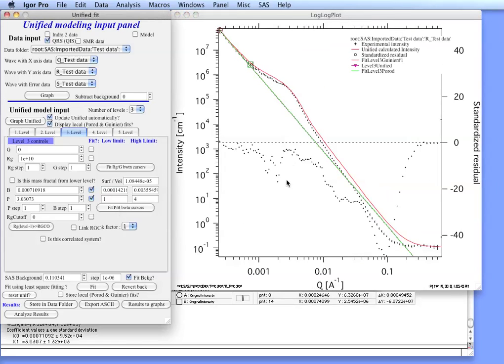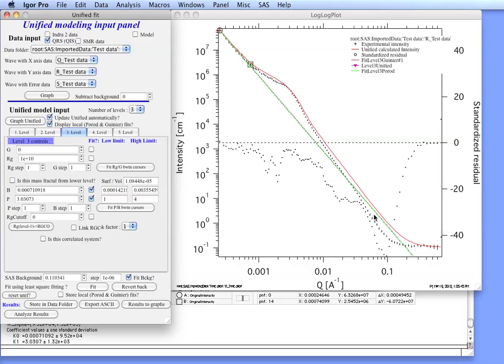As you can see we have fitted reasonably well the top part here. But what happens is that the predicted scattering comes up above the measured data at high Q. This is common for fractal type scattering where you have fractal aggregates with low power law slope and then you have primary particles somewhere later.